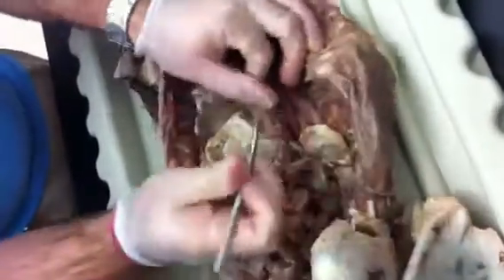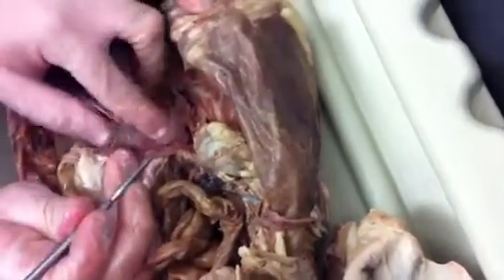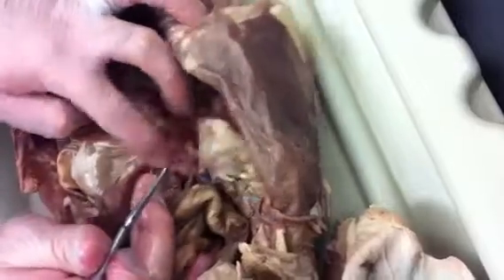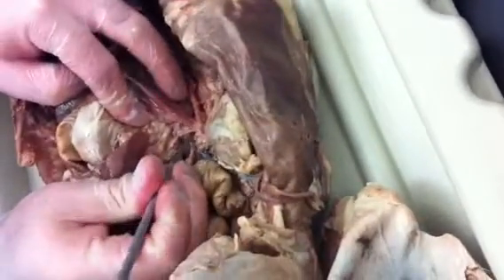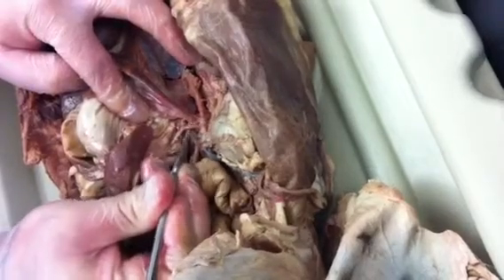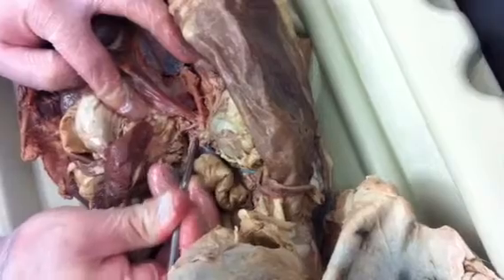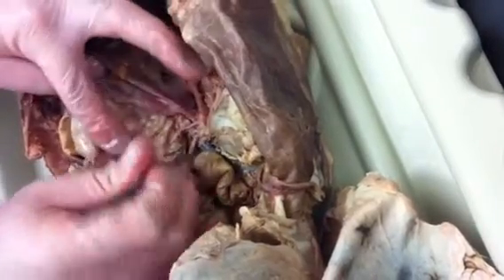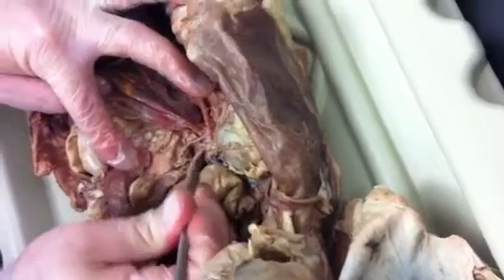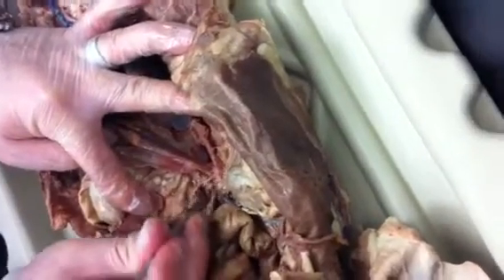So as soon as we get to the diaphragm, again, it's going to be hard for a lot of people to see, we branch. We branch right here 2 times. First branch, celiac trunk or celiac artery. And then the second branch, superior mesenteric artery. It's a lot easier to see. It goes out to the intestine. Usually it's larger and bigger. The celiac artery is kind of more difficult. So those are 2 branches off the abdominal aorta.